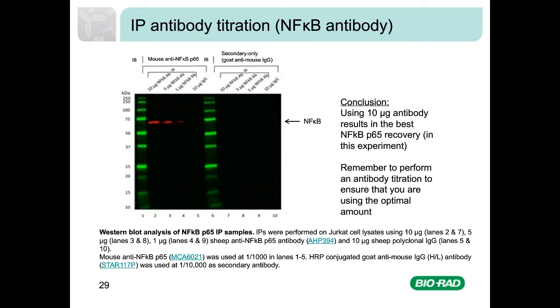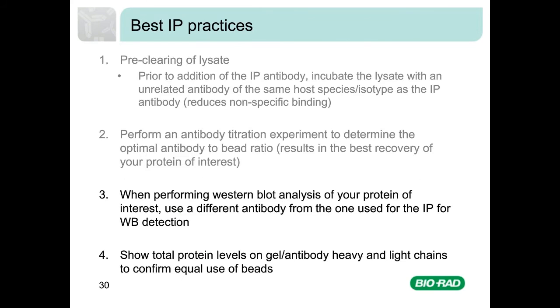The next piece of advice on best IP practice is related to the Western blot detection of IP samples. It's best practice to perform Western blot analysis of your protein of interest using a different antibody from the IP antibody. This increases the likelihood that the band present in the Western blot is your band of interest rather than a protein that the antibody is binding to non-specifically.